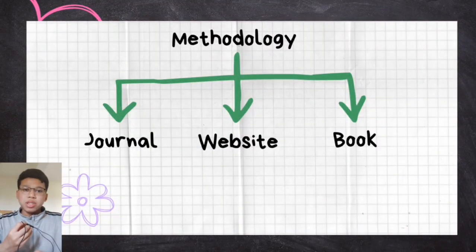My team conducted our research on the identification of caffeine and paracetamol in a pharmaceutical tablet by researching a journal through an online method, in order to find the chromatography method for caffeine and paracetamol in a pharmaceutical tablet. The next source is from a website, also found online. Lastly, we used a book that we got from the library.